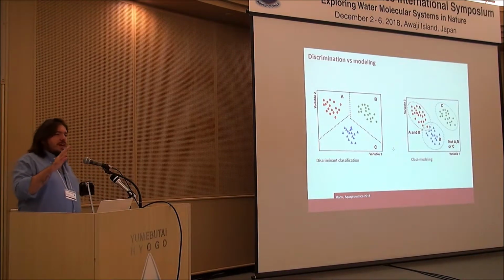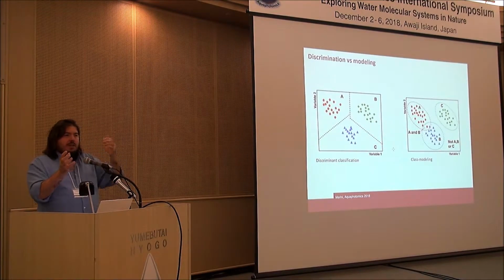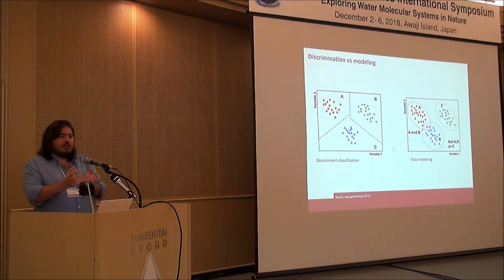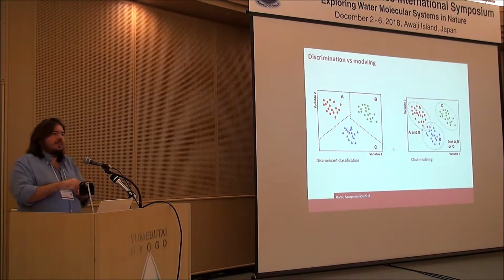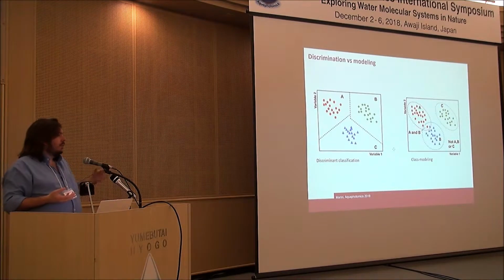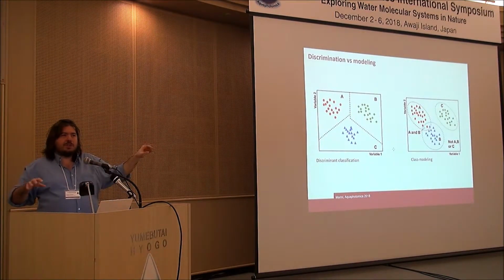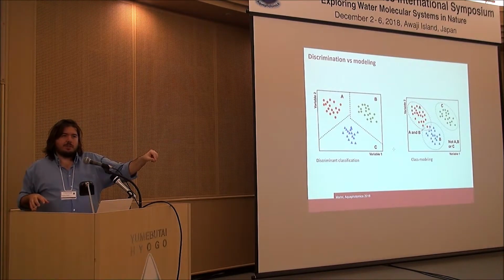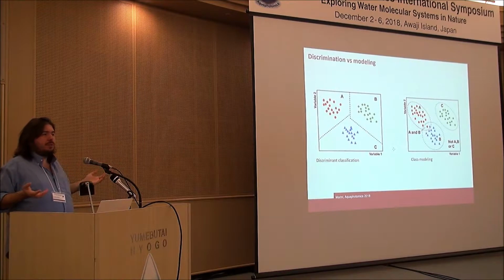Of course, this doesn't mean that if I have a second class that is still, let's say, homogeneous enough or well represented in my training set enough to be the base for an additional model, I can build the second model completely independent from the first, from that particular class. And this second model can be anywhere in space depending on where my samples are.